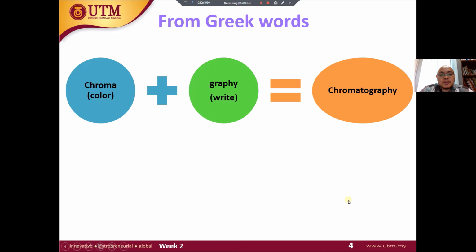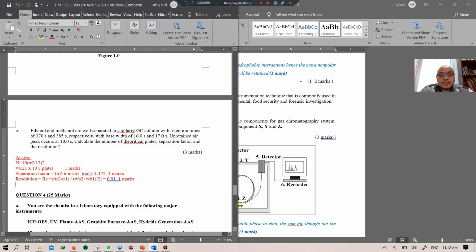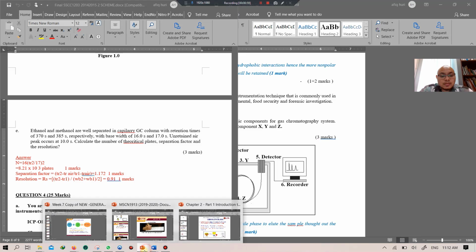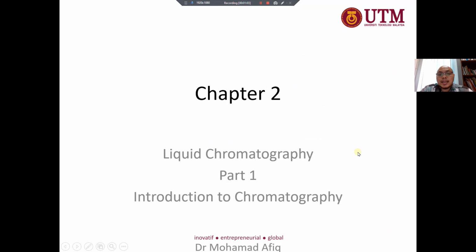Okay, I believe this is not the slide. Really sorry. Okay, here is your slide. So chapter 2, liquid chromatography, part 1. Before we go further, let's go back to the introduction to chromatography.